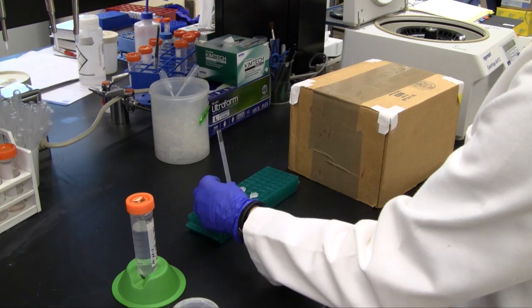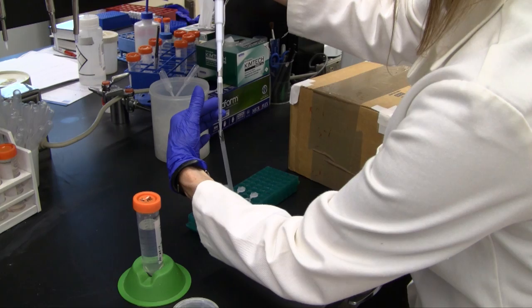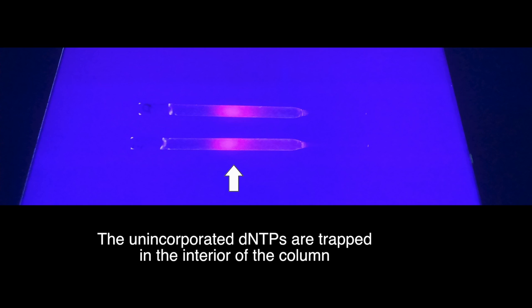350 microliters of TE is added to the column and the flow through is collected. Wait until there is no TE visible at the top of the gel matrix before moving the column to a new collection tube. This process is repeated 2 more times. The column is then examined under UV light to ensure proper function. Unincorporated dNTPs are trapped in the center of the column, while incorporated dNTPs pass through the column and into the collection tubes.